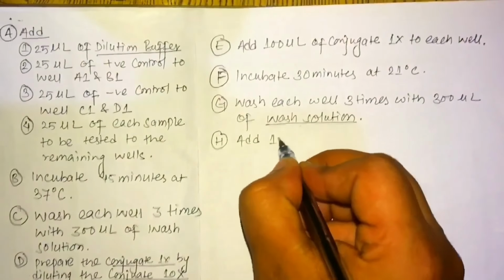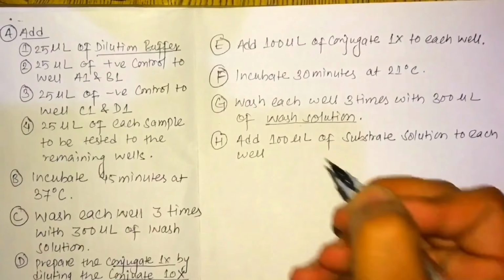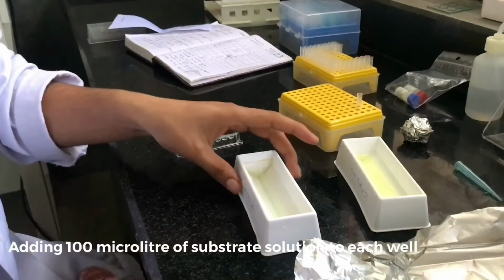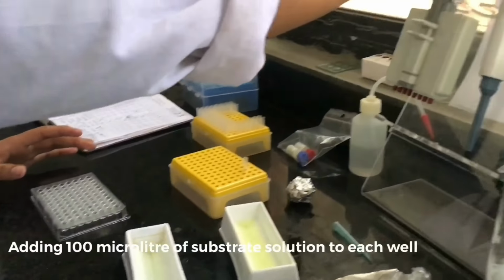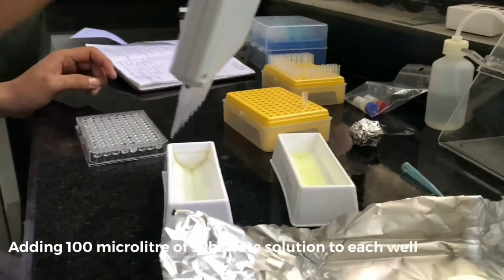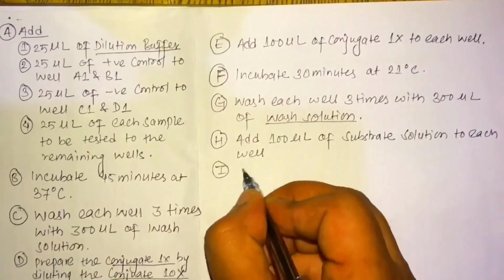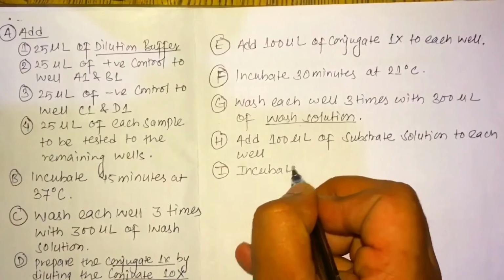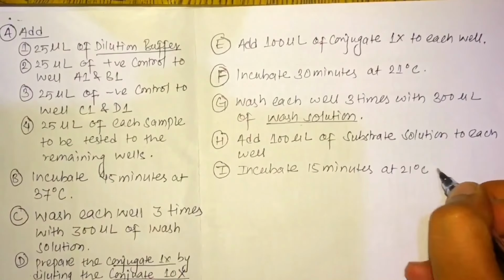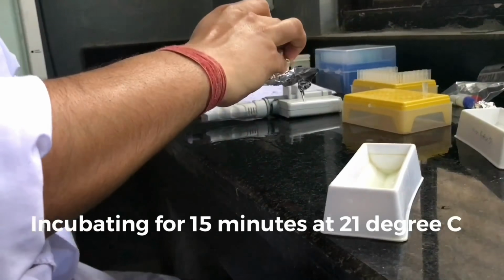After washing, we will add 100 microliter of substrate solution to each well. The substrate solution is also provided with the ELISA kit, so we will use that. This is the substrate solution. Now we will again incubate this for 15 minutes at 21 degrees Celsius in the dark. So taking it into the incubator, wrapping it with aluminium foil. So let's keep it inside the incubator for 15 minutes.